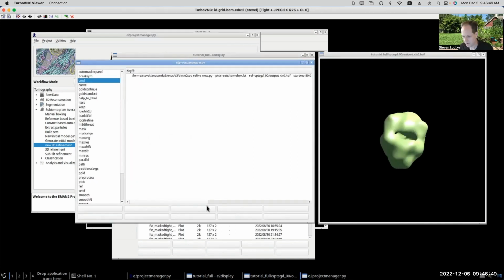You can also use numbers after the letter abbreviations for the types of refinements as a shortcut. So this is equivalent to PP, and this is the equivalent of TT. You can see I did 2 iterations of the 3D, then 2 iterations of 2D, then another 3D, and then another 2D. Then I did a rotational iteration, and then a focus iteration. I didn't follow that up by another T, which I probably should have, but anyway.